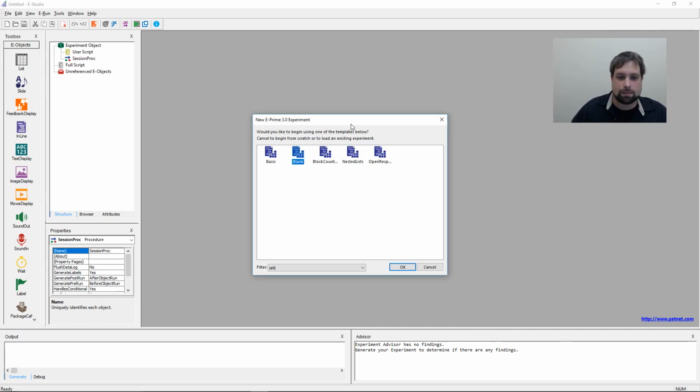So to go ahead and get started, what we're going to be doing today is a modified version of the IAPS task. Now, this is something we went over in our other webinar, but we have a few more changes that I've made to it to kind of streamline it a little bit more with Biopac. So before we were kind of sending generic signals from E-Prime to Biopac, now we're going to be sending more specific signals from E-Prime to Biopac. And it's actually going to be based on the stimulus that's presented.